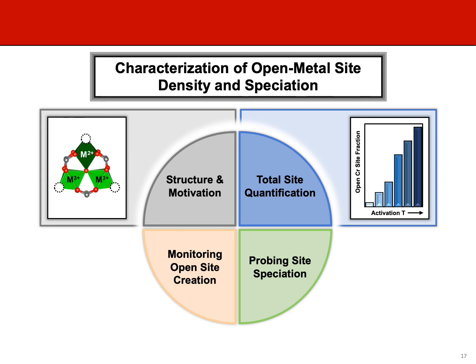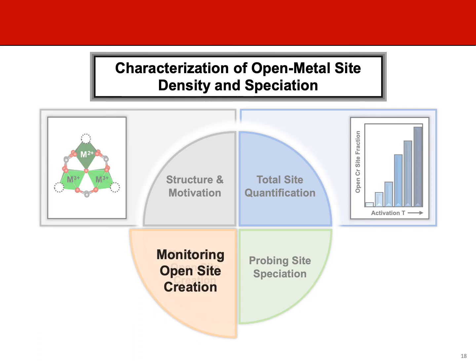So I've shown you that we get systematic trends that are consistent with our expectations and hypotheses when using the presented method of water adsorption for open metal site quantification. Now let's go in and see if we can monitor open metal site creation and thereby verify the open metal site counts that we obtain from water adsorption.